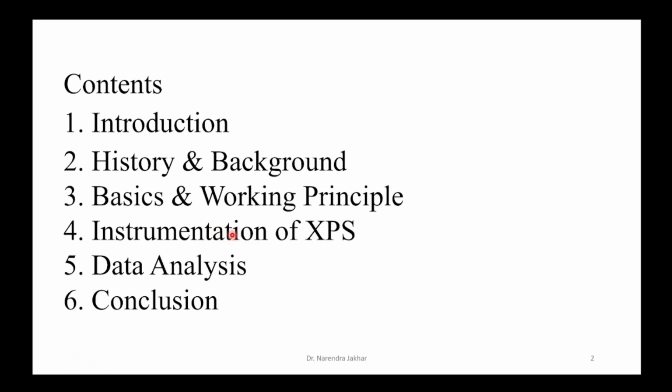In this topic, we will look inside the different instrumentation included in XPS, what the different parts are, what their uses are, and what their values should be to get optimized data, and so on.